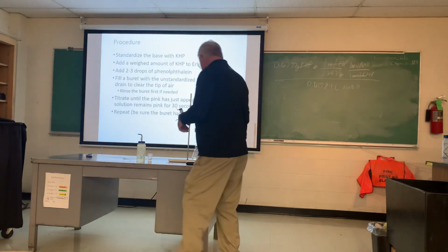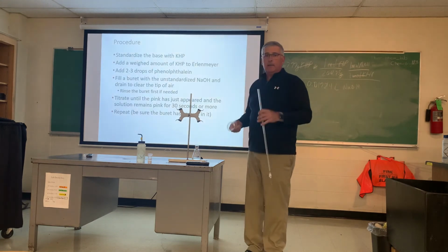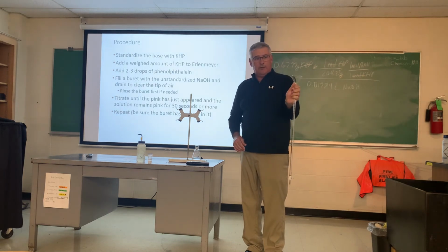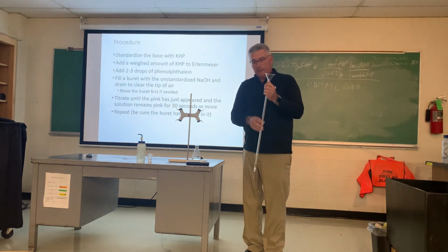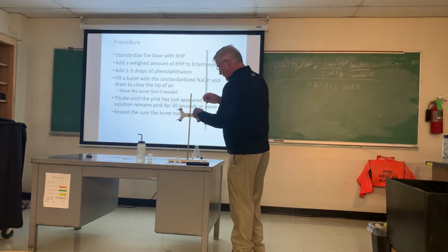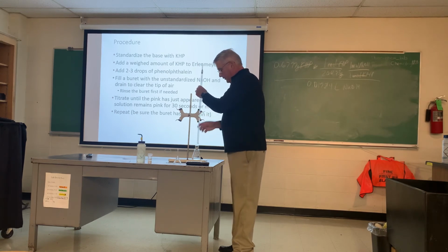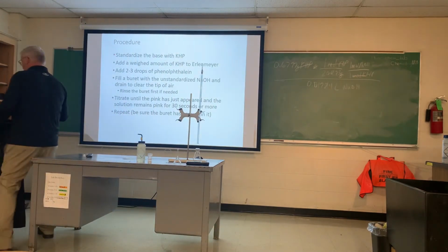Oh, one other thing I kind of forgot to mention, when I'm filling a burette, don't forget, guys, never fill one above your eyes. Put the burette below your eyes, and when you use a funnel, take your thumb and lift the funnel so that air can go in, and then fill slowly up to the point that you need it to be filled. So I'm going to put this back in the stand, tip up to store it until lab time. All right.